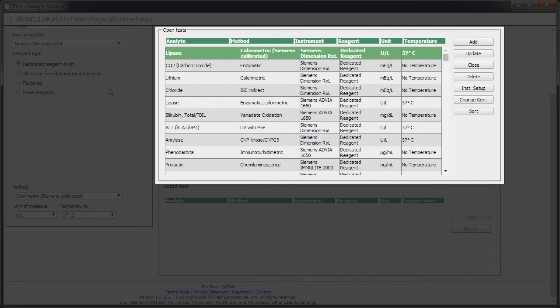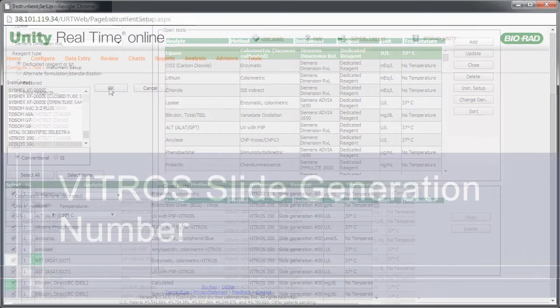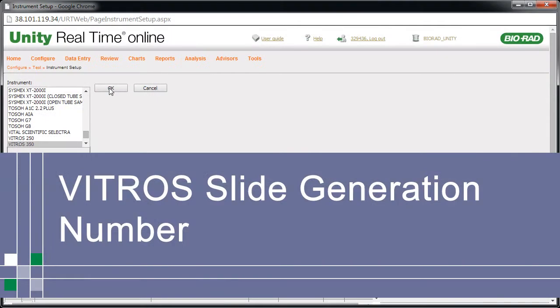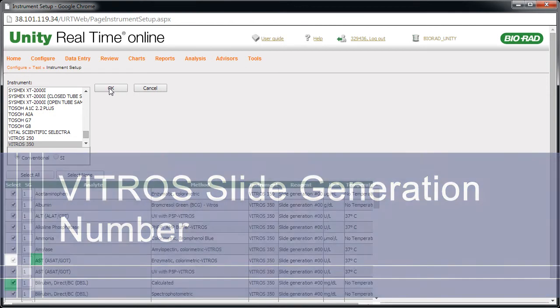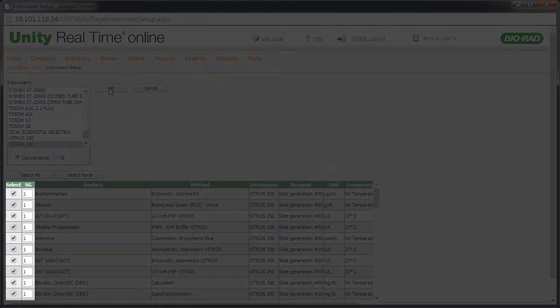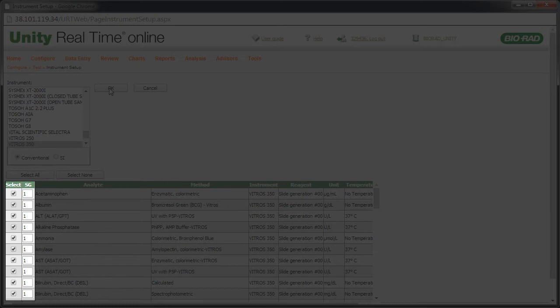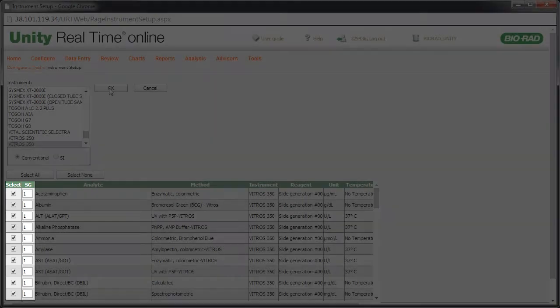Review each test to ensure that it's configured correctly. Please note that if you're a customer setting up a Vitros instrument, in addition to clearing the checkbox for tests you don't run, enter the slide generation number.